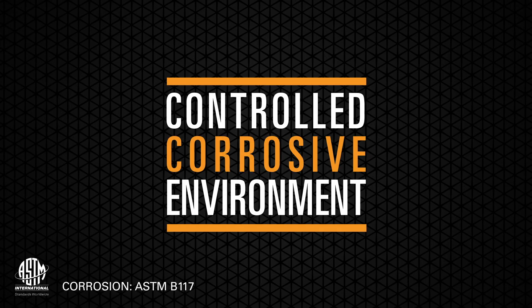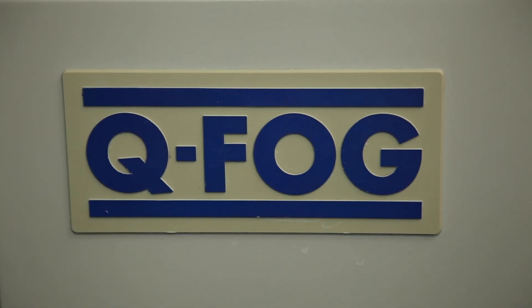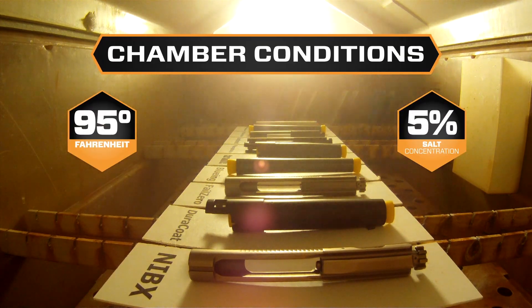According to ASTM B117-03, the corrosion test provides a controlled corrosive environment which has been utilized to produce relative corrosion resistance information for specimens of metals and coated metals exposed in a given test chamber. The salt chamber is set to a temperature of 95 degrees Fahrenheit with a 5% salt concentration.